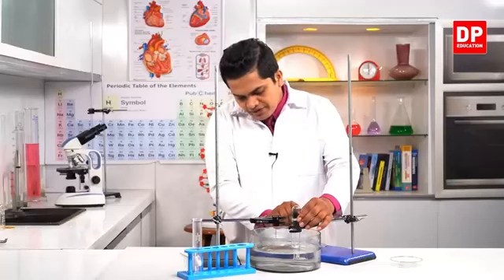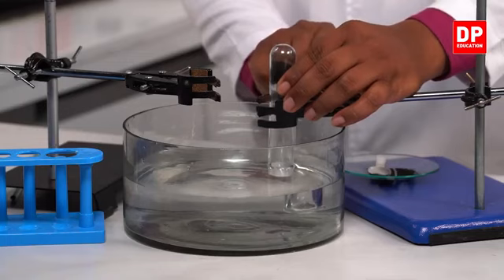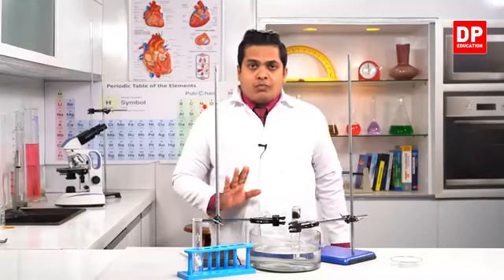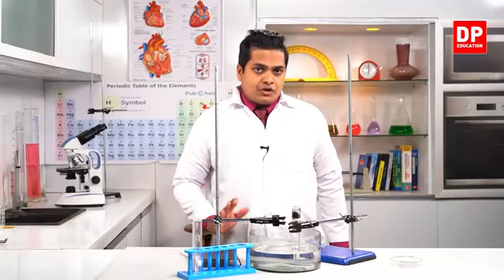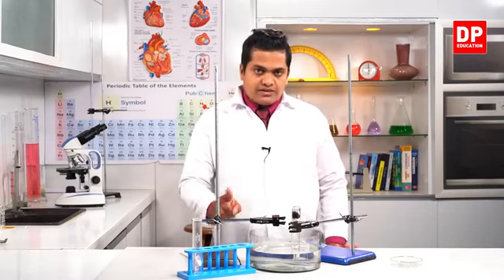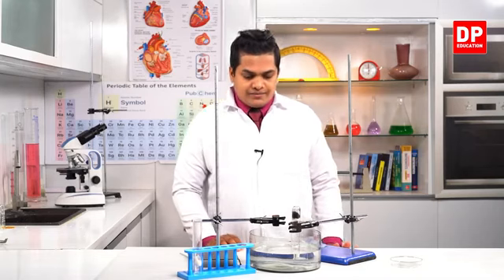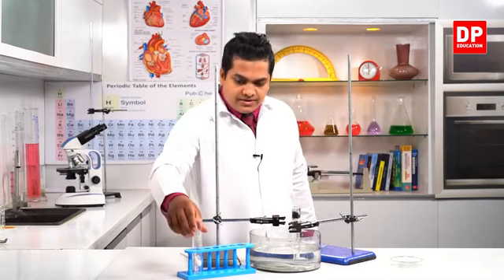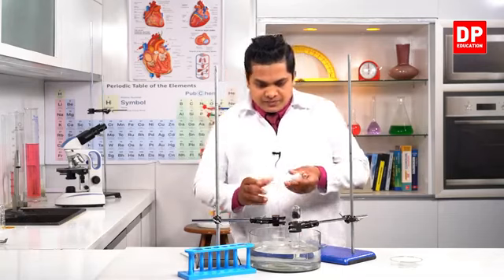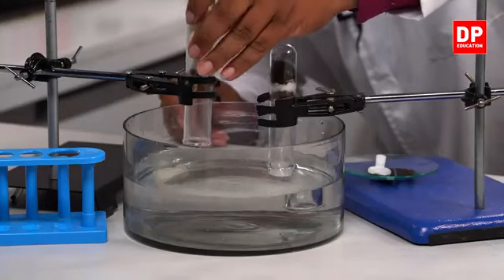Remember, when you are fixing these boiling tubes inside the water trough, both the boiling tubes should be at the same level, my dear children. Remember it. So we'll insert the second one also, by looking at this level.